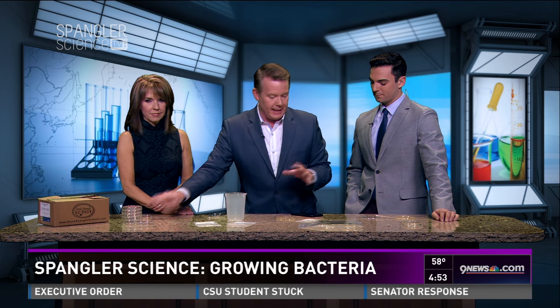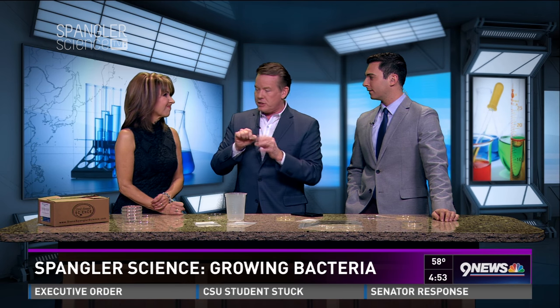A cell phone: absolutely disgusting. A remote: beyond disgusting — because you've got all those little nooks and crannies. And then, believe it or not, the top of the soap pump was pretty bad too.